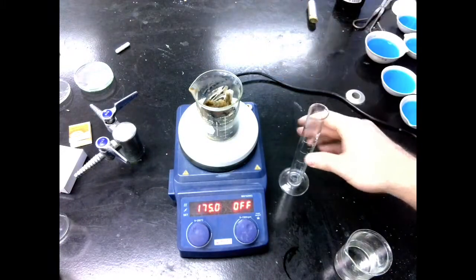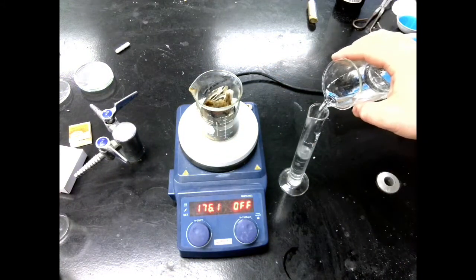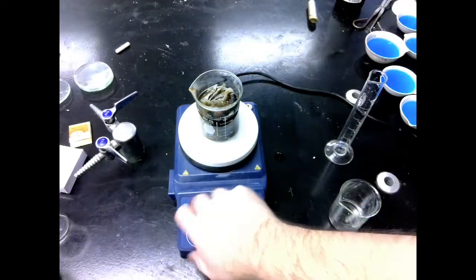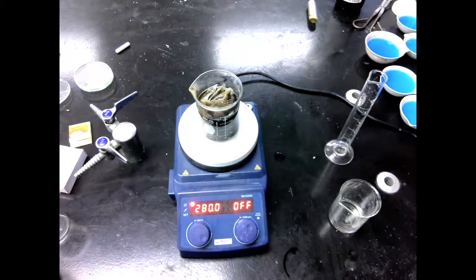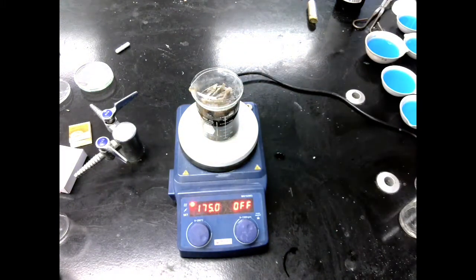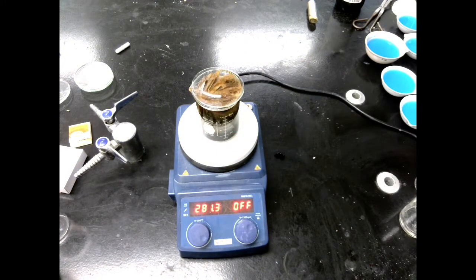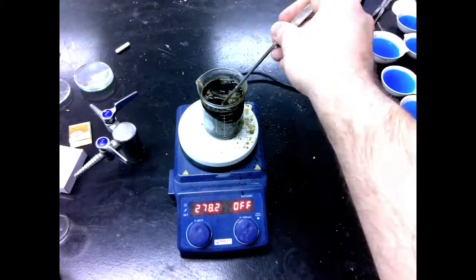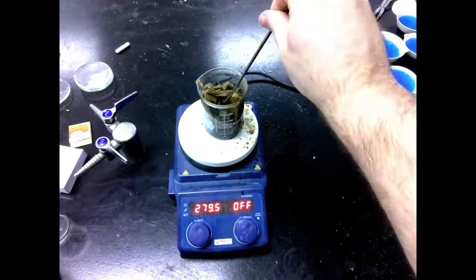Again, distilled water. We don't want to use tap water. That will mess with our solution. Then bring it back up to a simmer, and we're going to do the same process over again. Put the watch glass on, let it come up, and then if it does start to boil over here, we can just take the watch glass off, stir it around, turn down the heat, so on and so forth.